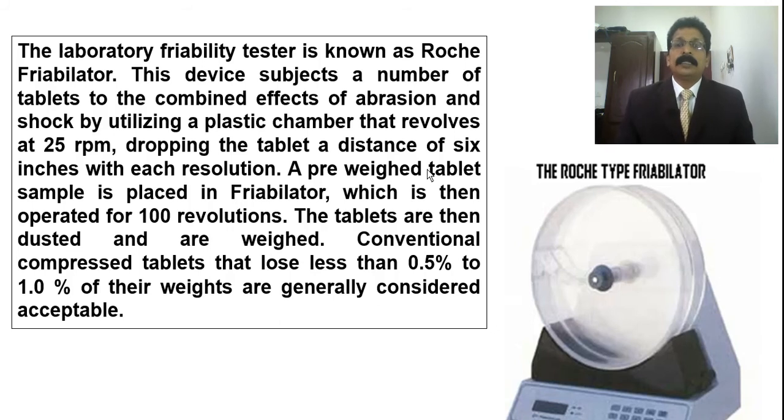The tablets are then dusted and are weighed. Conventional compression tablets that lose less than 0.5% to 1% of their weights are generally considered acceptable.